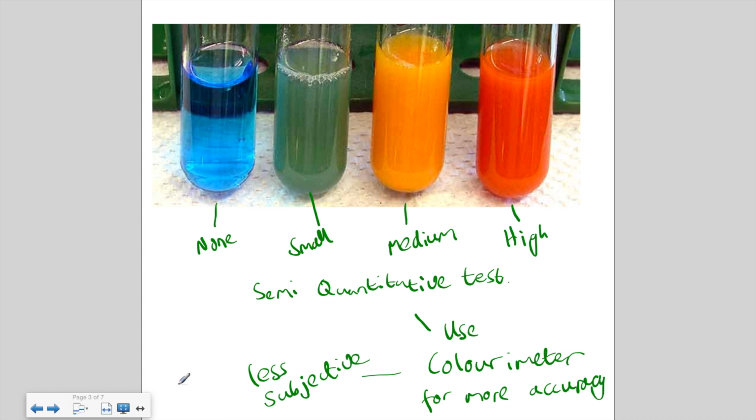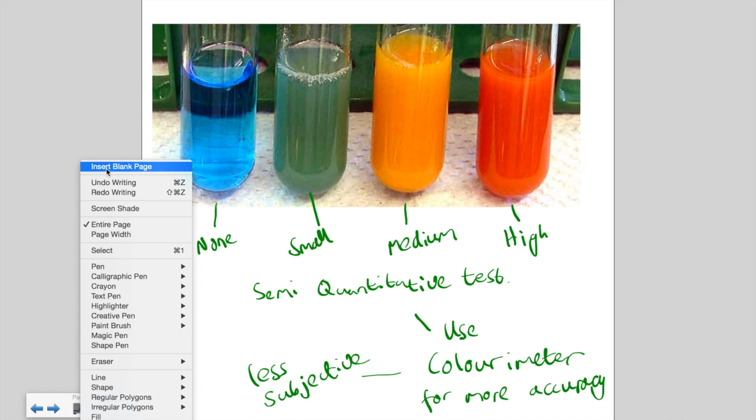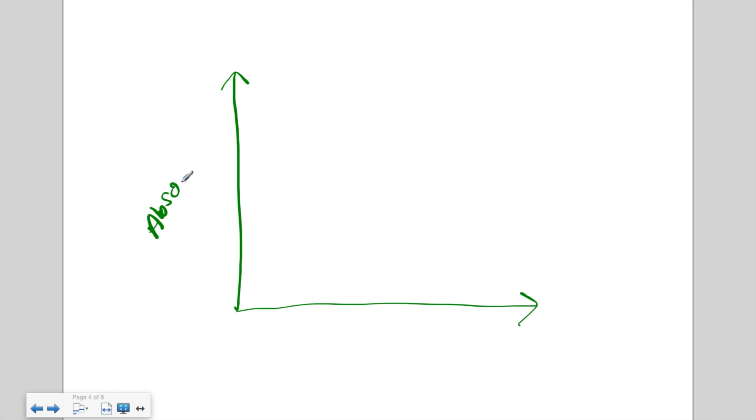So you think about your calibration curves, they look like this. Sorry, you'd obviously use a ruler, but just for a quick sketch here. Here you'd have the absorbance reading from the colorimeter, in arbitrary units. And here you could make up a load of known glucose concentrations in percentages.